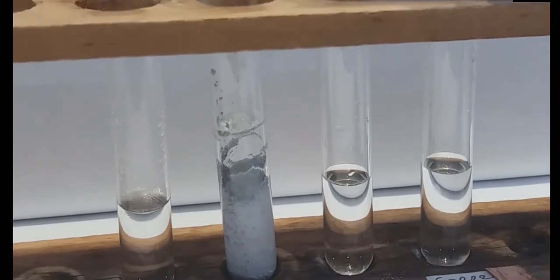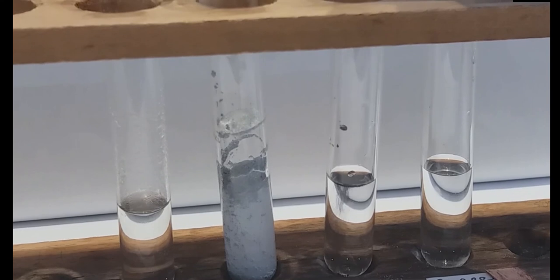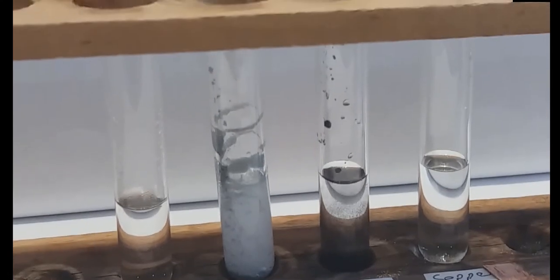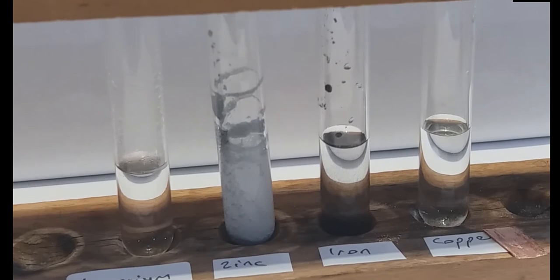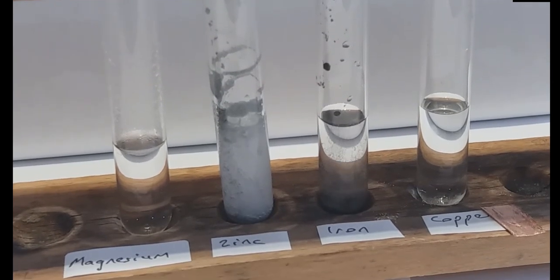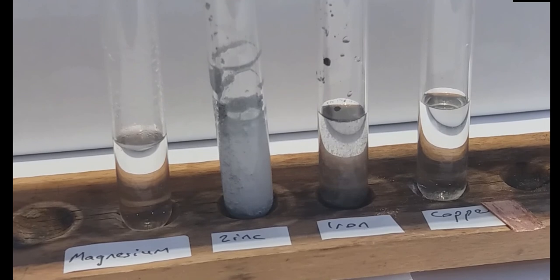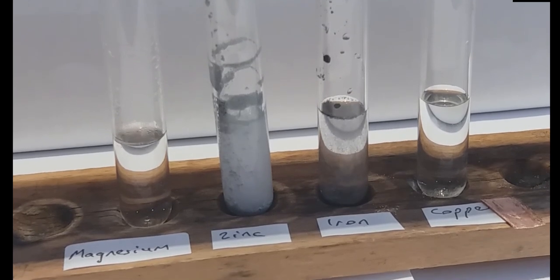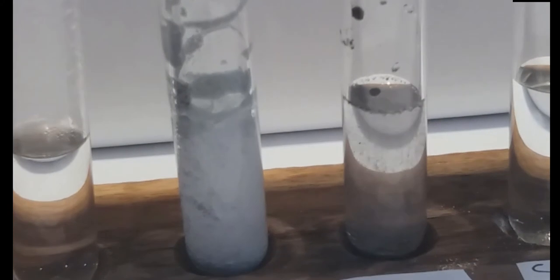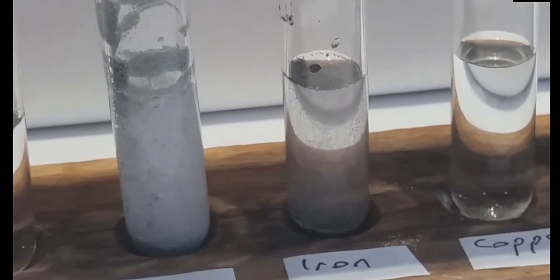Here's a little bit of iron powder going into the next test tube, and hopefully you'll see after a short delay you get a slightly better reaction of the iron powder than we did with the iron nail, and you see some of the hydrogen being given off there. Again, nowhere as fast as zinc. So yeah, that's going to be less reactive.